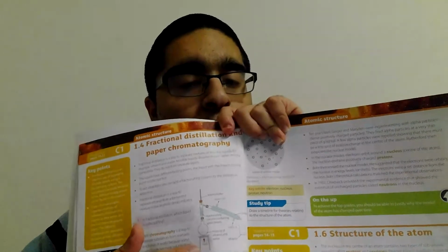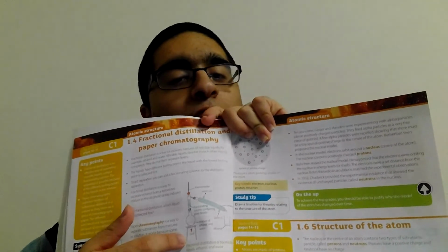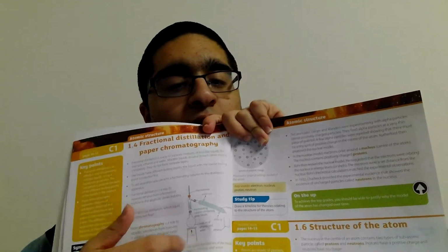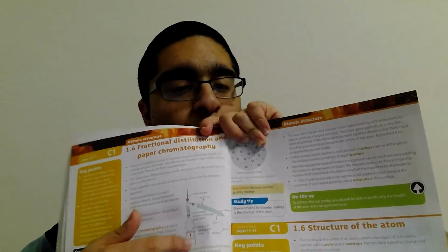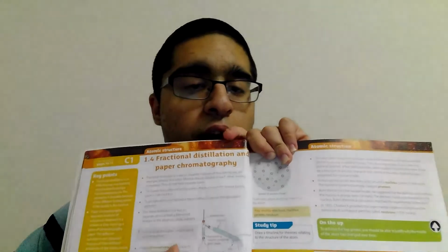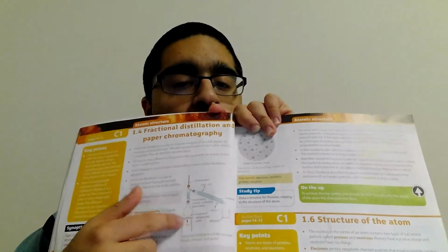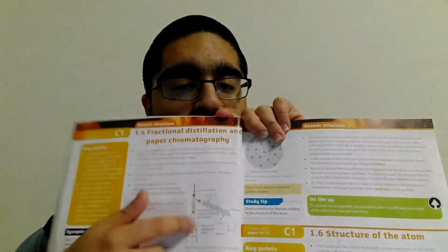So this shows the apparatus for fractional distillation. You have heat being supplied to a tripod, and there's this flask here, and then you have a fractionating column.